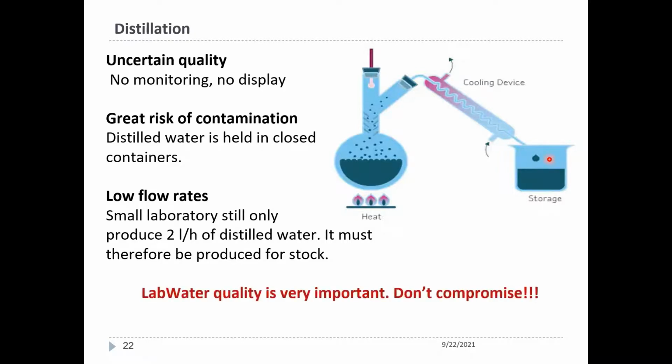Is it worth it? Lab water, any water you use in the laboratory, is very, very important. That determines the result. So if you have errors in the end, if you have bad results in the end and you are troubleshooting, where do you go back to? Is it your glassware that wasn't properly cleaned, or is it the water you use that wasn't of the best quality?